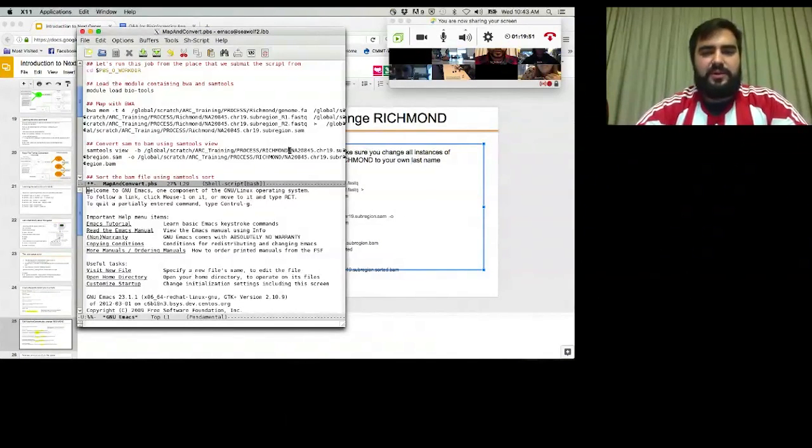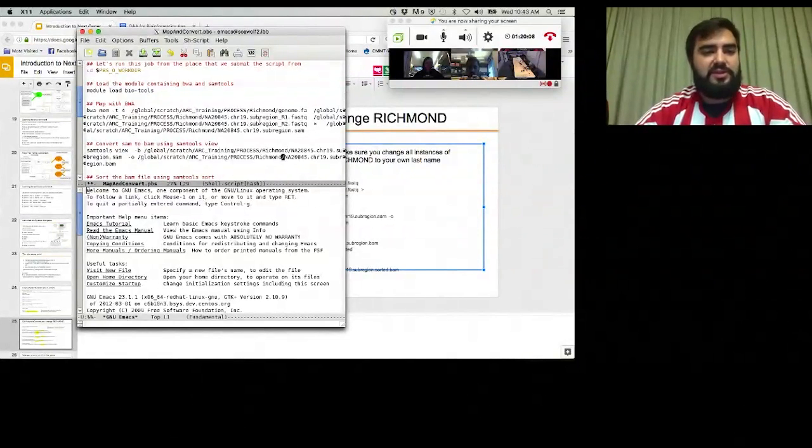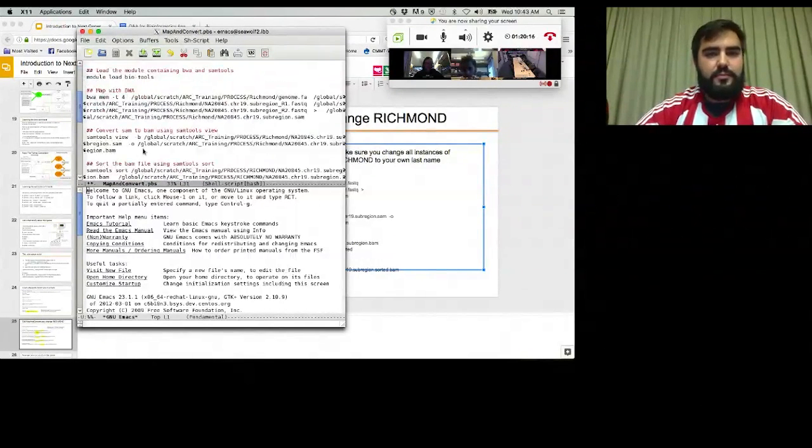And while I'm doing this, I will just say that I have been using these scripts for many years, and I still will copy a script and use it as a template for a different job, and I will swap out the locations of things like file paths, but that way you don't actually have to retype all of this every time. A couple more things to change.